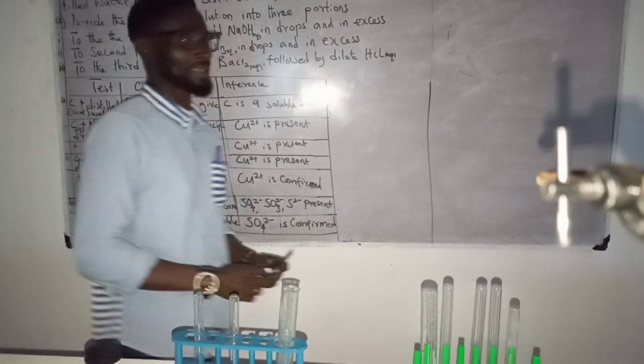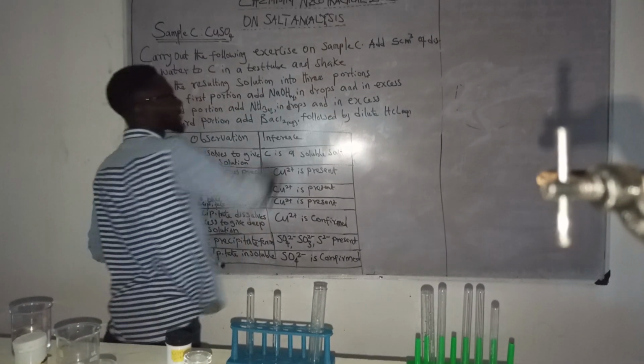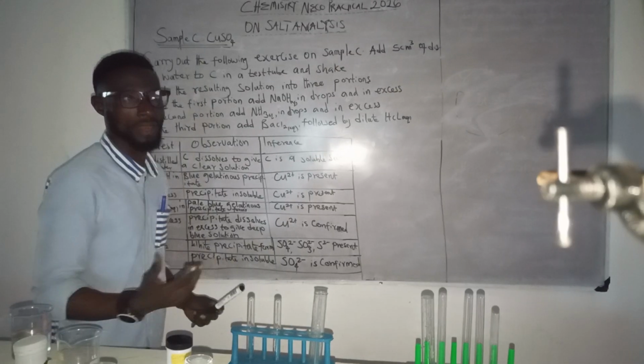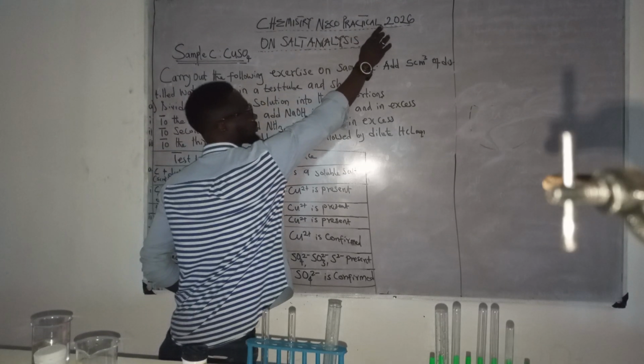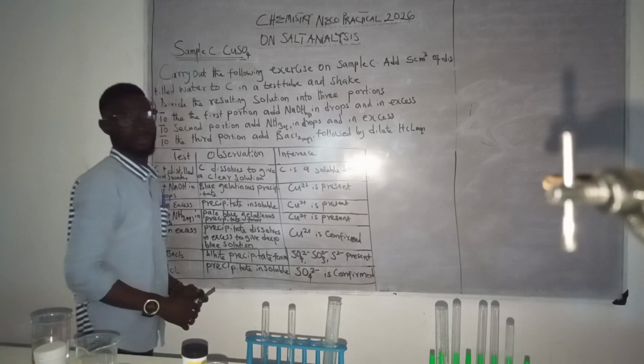Alright, quickly, in my previous video, I had a shoot about chemistry NECO practical 2026, and that was precisely on how to prepare a reagent. But in this video, we'll be looking at chemistry NECO practical 2026 on salt analysis.